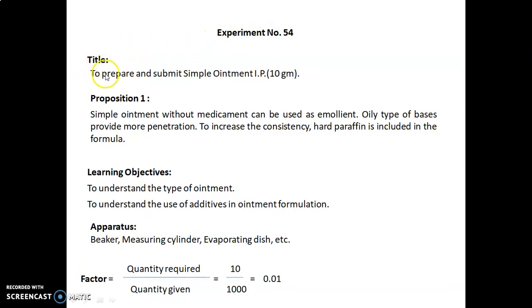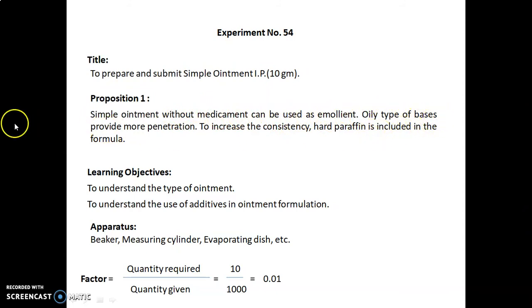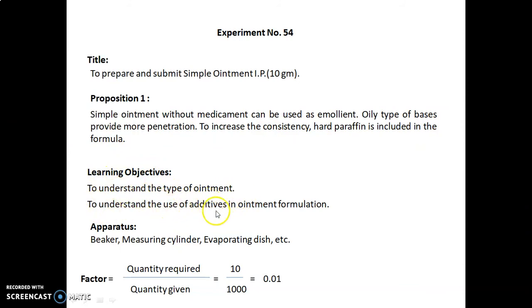Experiment number 54: the title is 'To prepare and submit the simple ointment IP' — that is, according to Indian Pharmacopoeia — for a 10 gram proposition. A simple ointment without medicament can be used as an emollient, oily-type basis. Hard paraffin is included in the formula to increase consistency. Learning objectives are to understand the type of ointment and the use of additives in ointment formulation. Apparatus required: beaker, measuring cylinder, evaporating dish, etc.